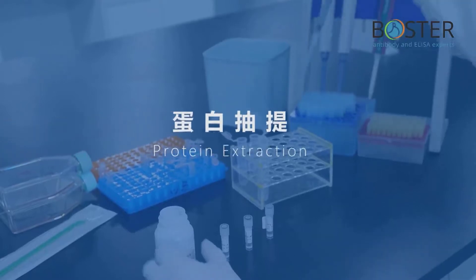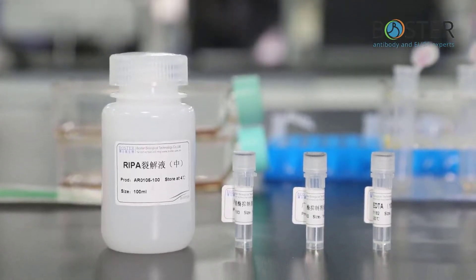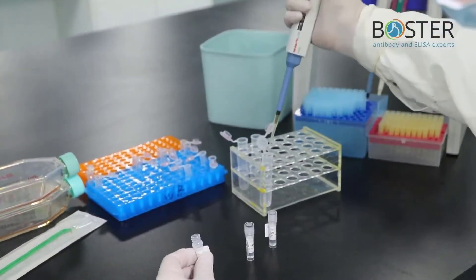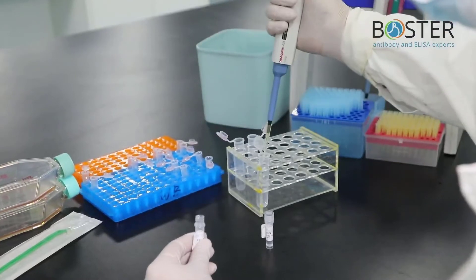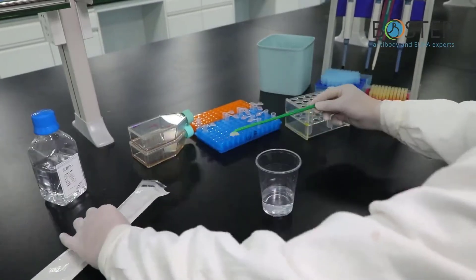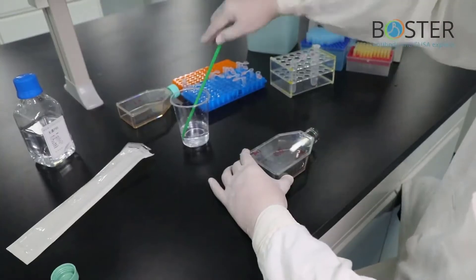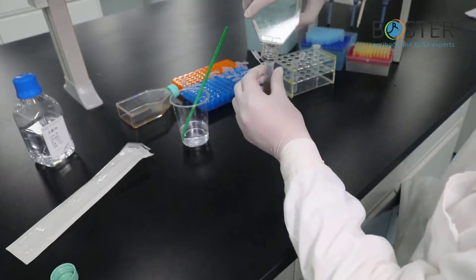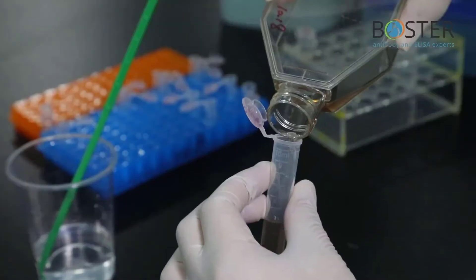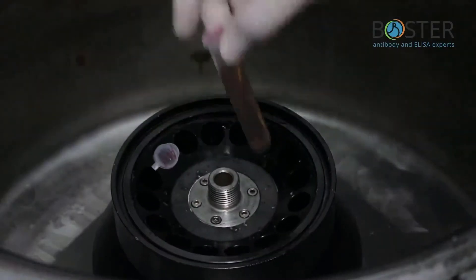Step 2: Protein extraction. These are the products needed for the protein extraction process. Configure lysate — estimate the total amount of sample to prepare lysate. Add 10 µL of protease inhibitor and 10 µL of phosphatase inhibitor per 1 mL of lysate. For adherent cells, scrape off cells with a cell scraper and transfer the culture medium containing the cells to a centrifuge tube. For suspension cells, shake the flask gently and transfer the culture medium to a centrifuge tube. Centrifuge at 3000 RPM for 3 minutes.